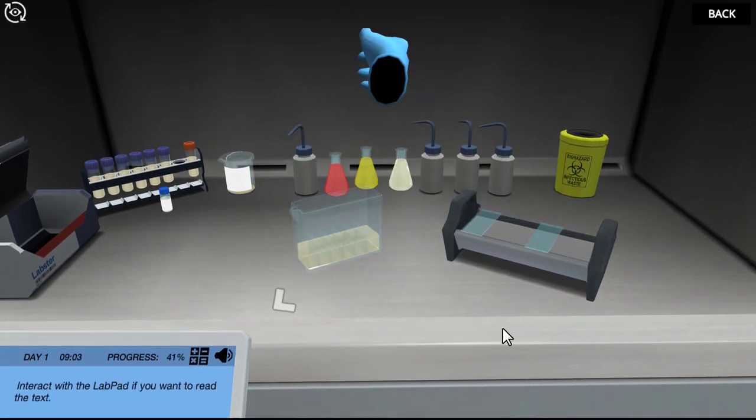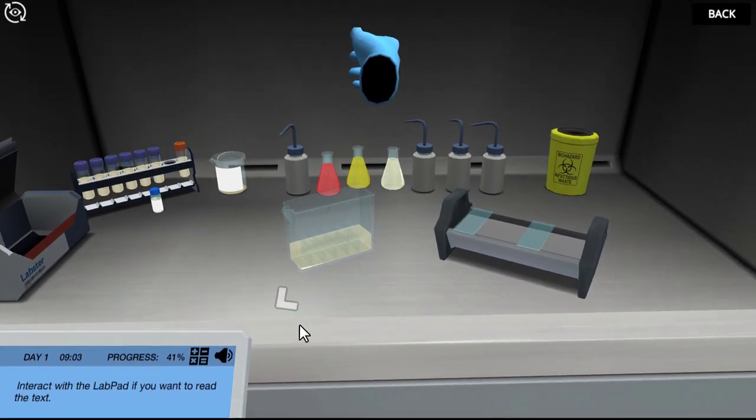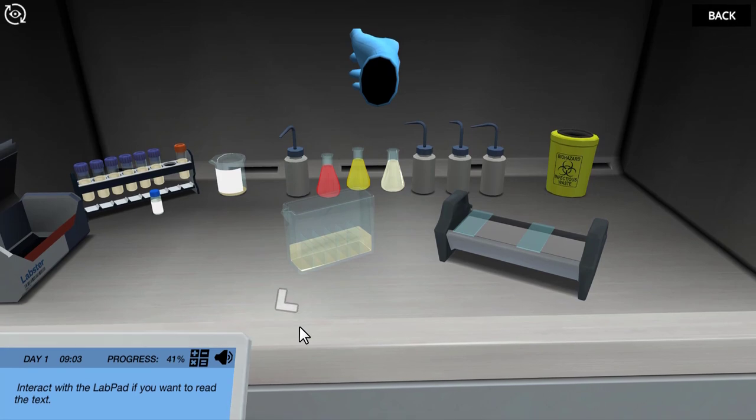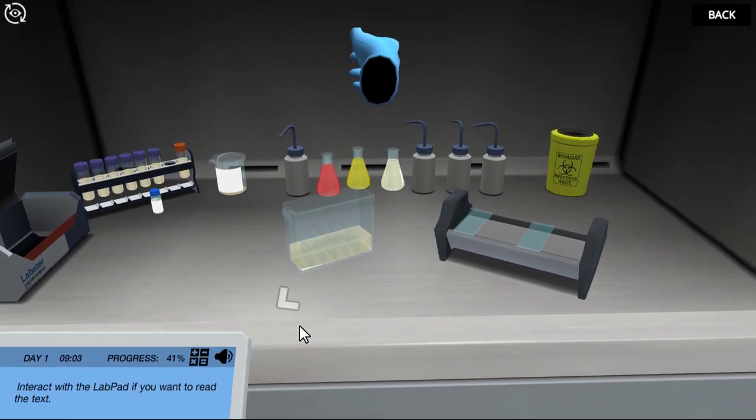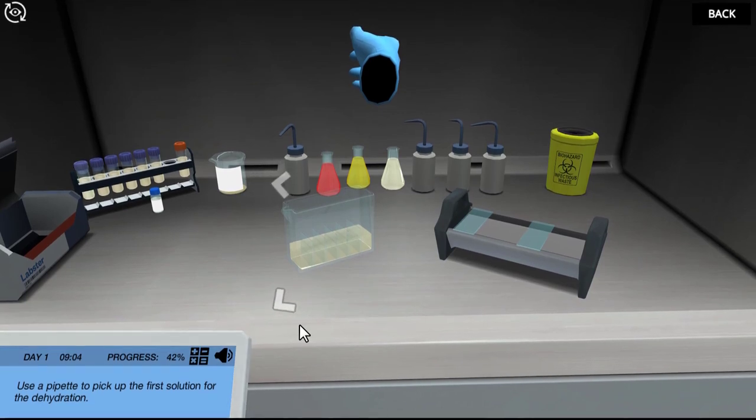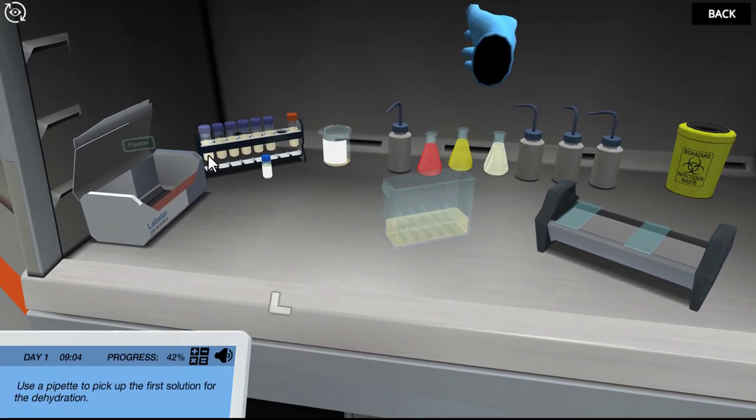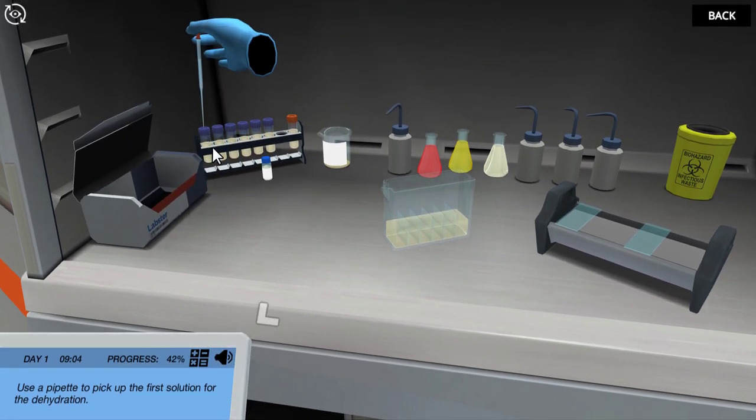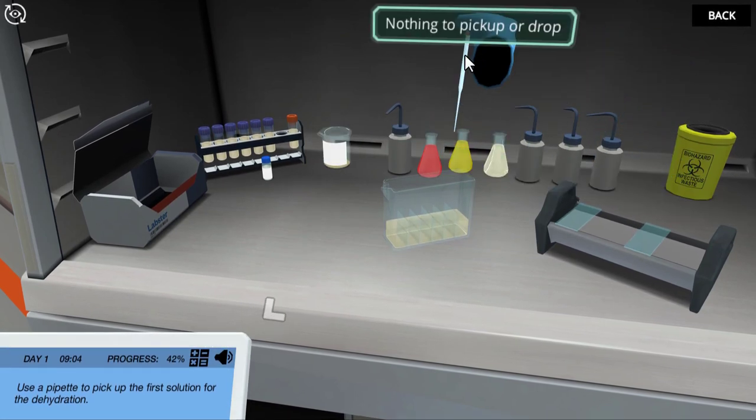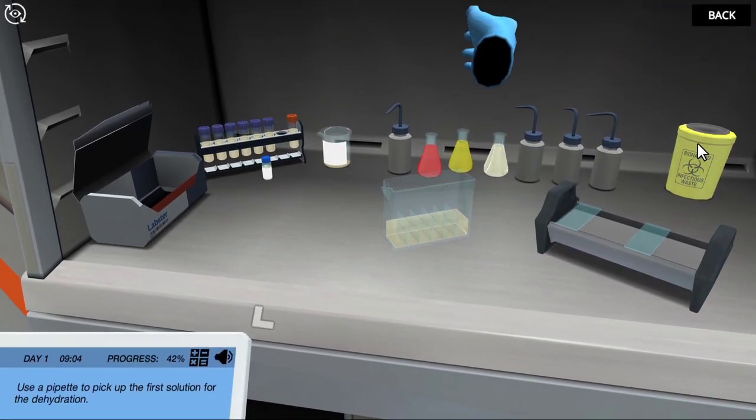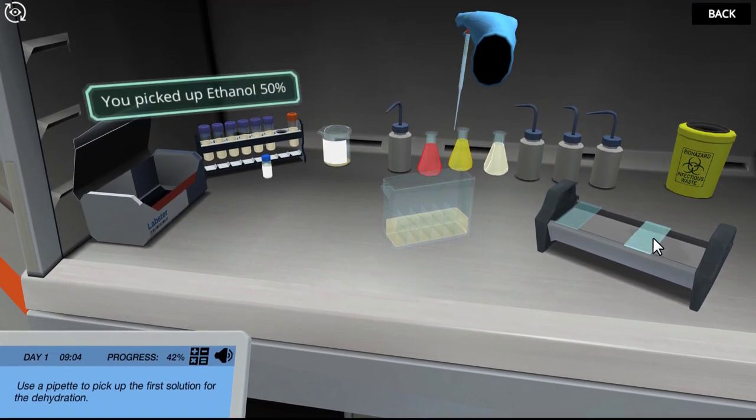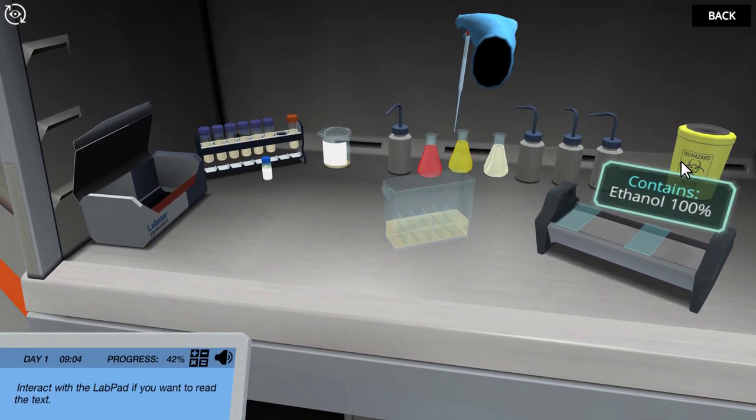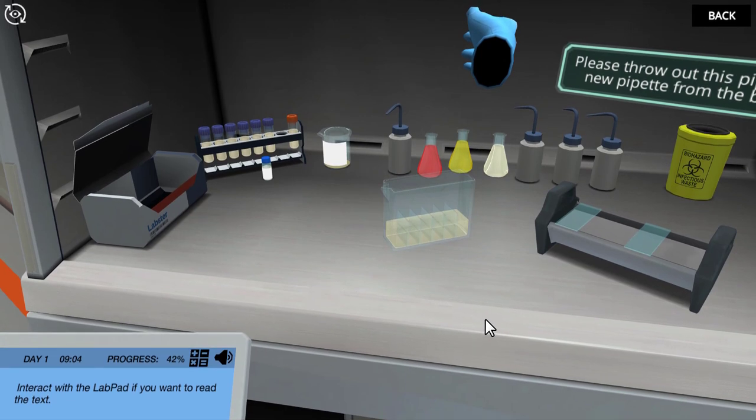Now we need to get rid of the water to create a dry and permanently fixed slide that won't be degraded by oxygenation or bacterial contamination. This is accomplished with an alcohol dilution series from 50% to 100%, and then xylene. Be careful these liquids are highly flammable. Use a pipette to pick up the first solution for the dehydration. I have completed the remaining alcohol dehydration steps. Don't you wish you had a drone for a lab assistant in real life too?